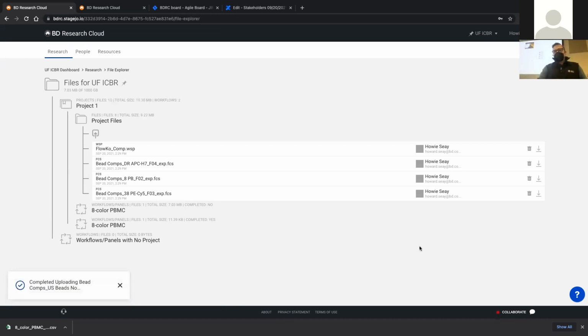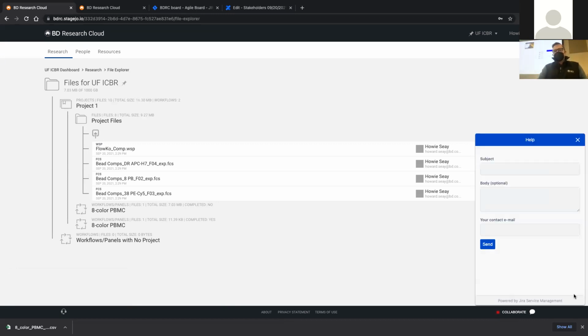Being a beta test site, we also definitely want your feedback. So in the bottom right corner here, we have a little feedback button. Make sure you don't miss that. You're like, Howie, I want BD Research Cloud to do this. Be a squeaky wheel and you'll get it. You might not get it next week. It might take me a couple months. But my job is to make your life easy. And if you tell me how to do it, then it's possible. Obviously a group of squeaky wheels gets their things made, but it never hurts to let us know.